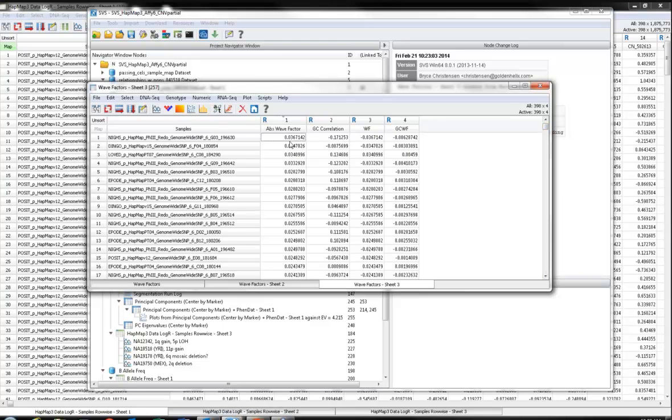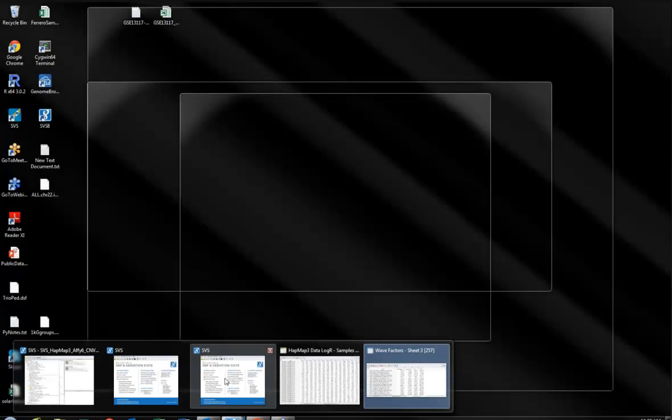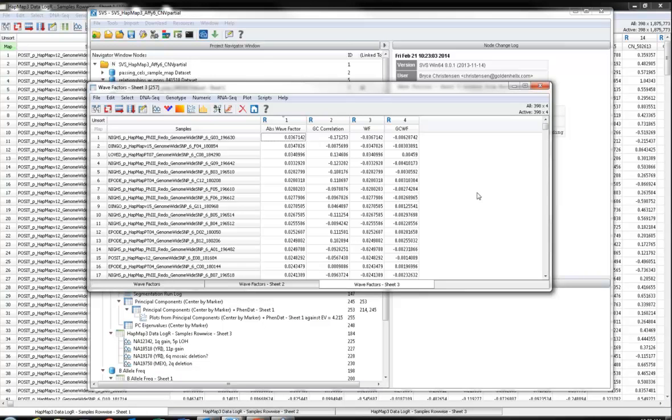Sometimes you will see some really high outliers in this, and what that will correspond to is a pattern we see fairly often in CNV data of almost like a sine wave as you go down the length of the genome. So as we looked at that one sample, it was pretty flat down the length of the genome, even if it was a bit noisy. Sometimes you see this sort of up and down pattern that correlates typically with regional GC content in that area of the genome. But we're able to detect that.